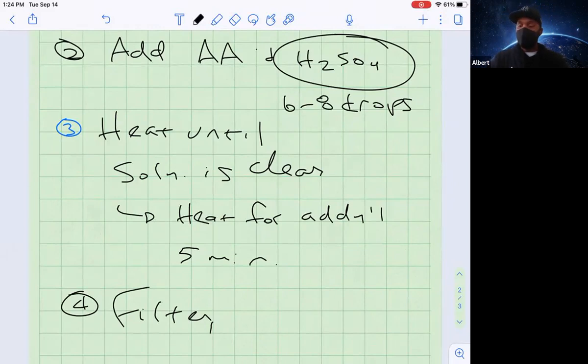But if you heat it and then it cools down some, it's going to go solid. So for those of us who are here, we're going to make sure that we keep it immersed in the water bath at all times and keep moving it. Keep swirling it to make sure that it doesn't go solid on it. That's the only misstep that happens with this part.